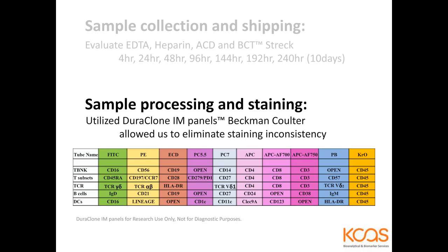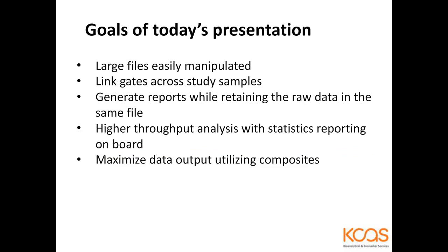So for each donor, this gating on just % positives versus negatives, that's 6,480 data points per donor, and we decided to look at 3 donors in order to have a full set of information so I could do some statistics.